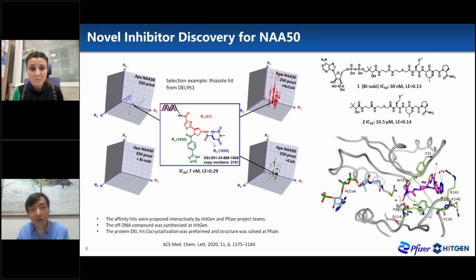R3 is also a 1,800 different acids here. We plot all of the NGS data here to see whether there is some feature, as I just mentioned, a line feature or plane feature, to see whether the signal is good or not. Okay, and the size of these dots? The size is relative to the reads of the sequence.